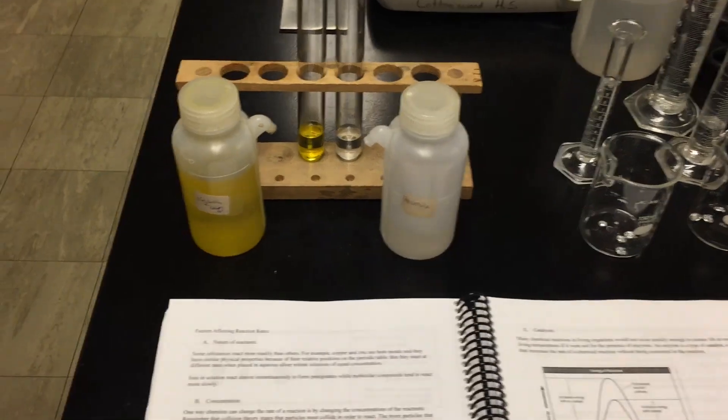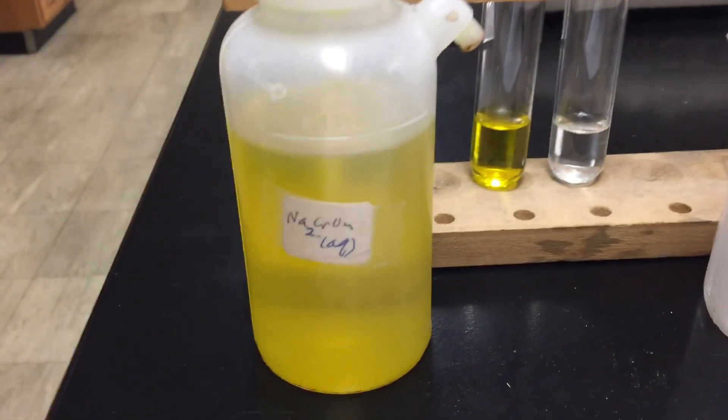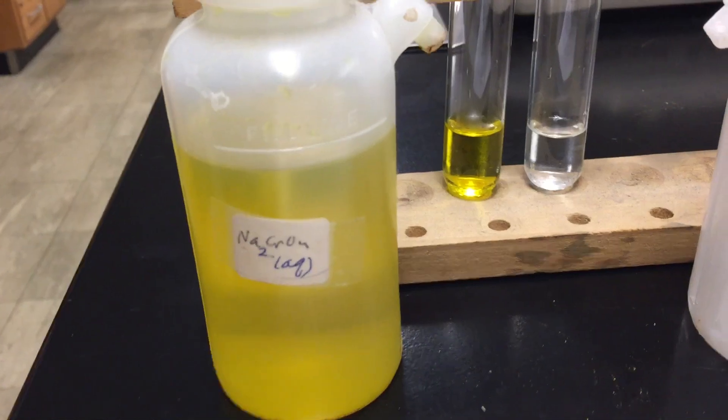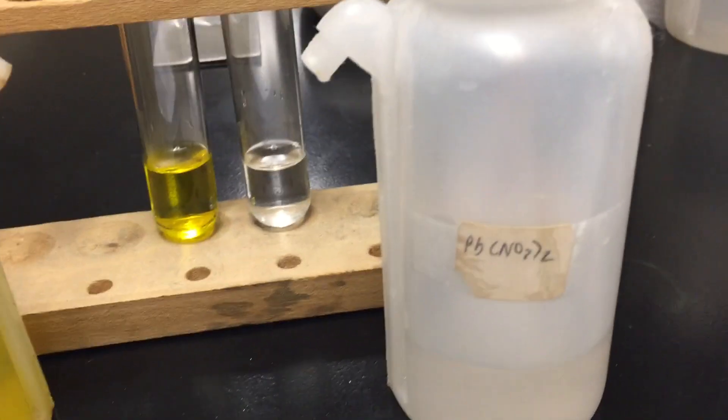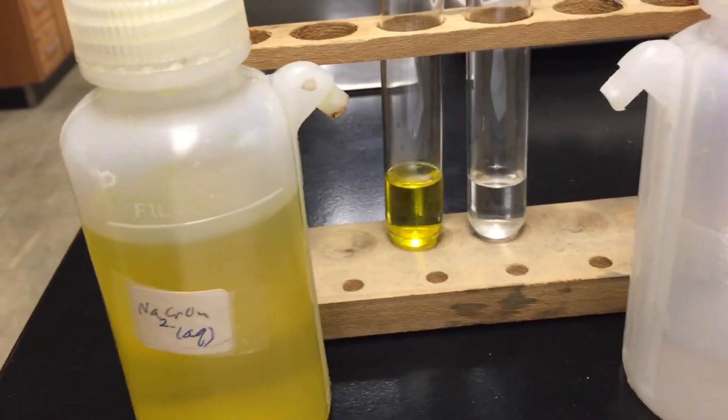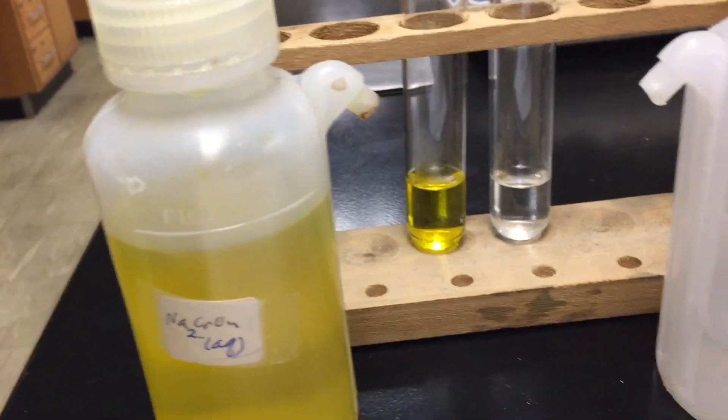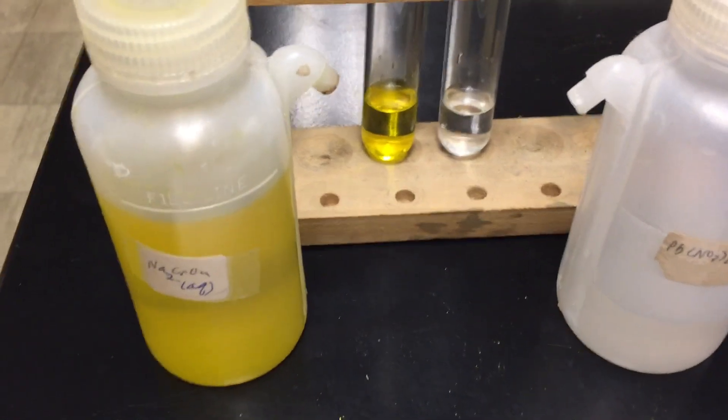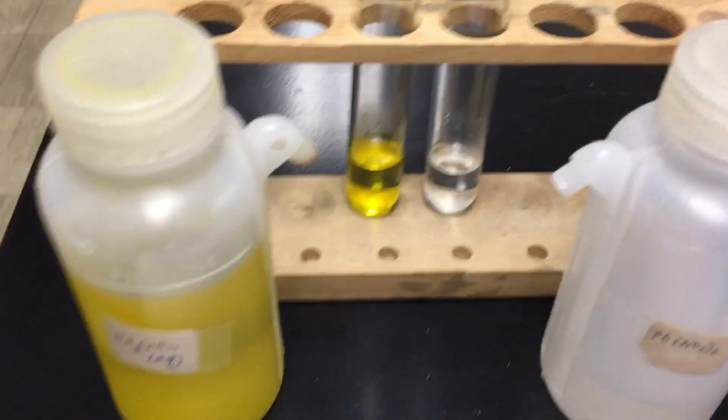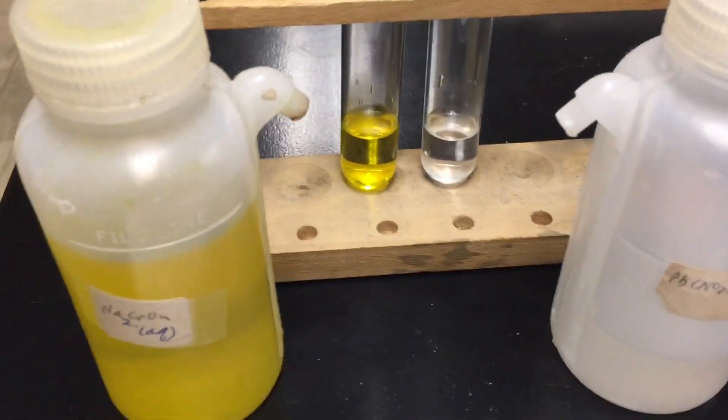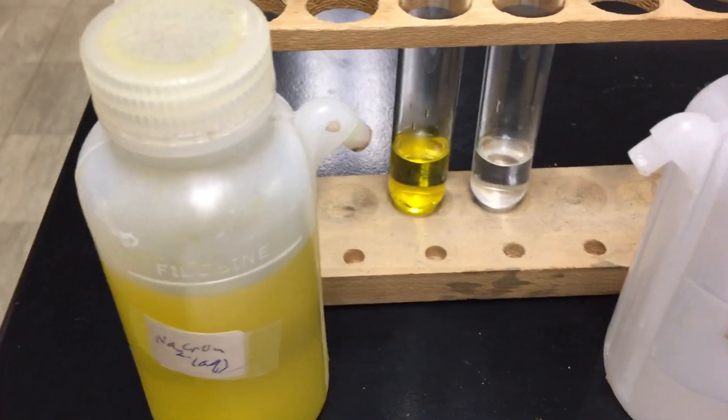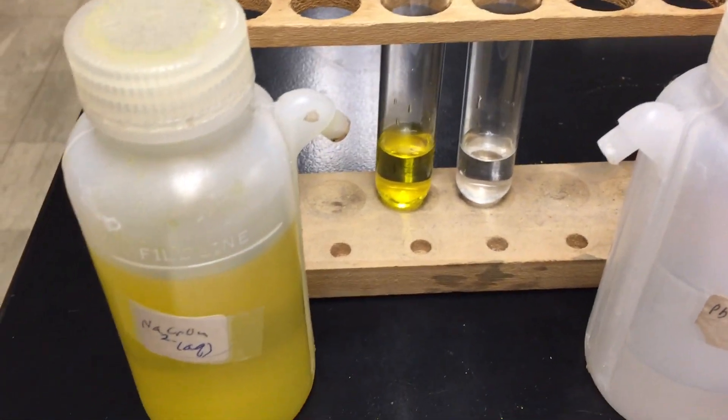The first factor will be the nature of reactants. I have a couple of ionic compounds here, sodium chromate and lead 2 nitrate, and they have been dissolved in water, so we have ions in solution. Now, ions in solution react at a very fast rate. We'll have the positive lead ions being attracted to the negative chromate ions, and that's an instantaneous reaction.